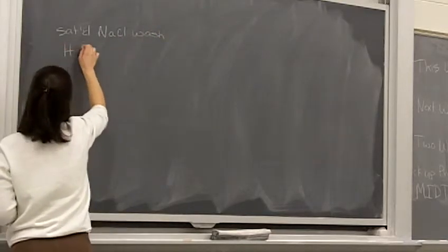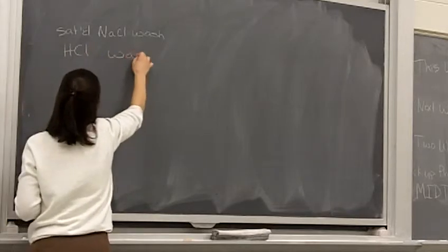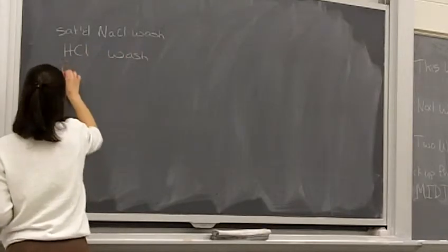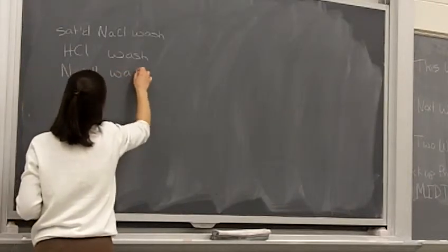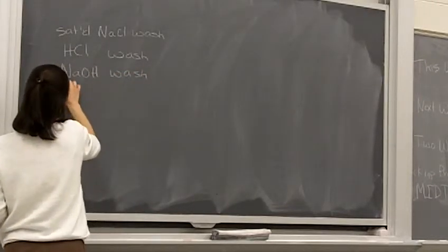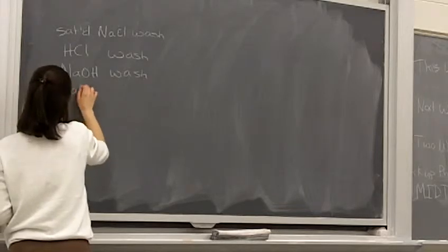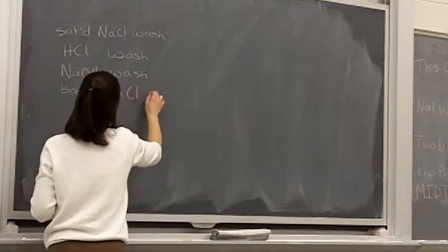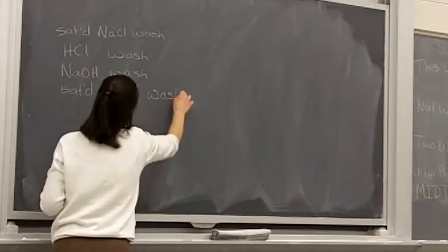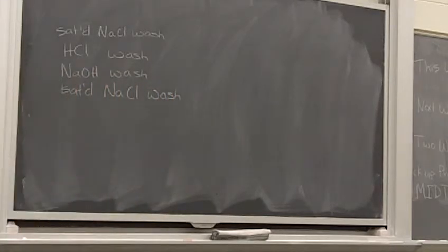We've got an HCl wash. We've got an NaOH wash. And we've got another saturated sodium chloride wash. Okay, so we've got these 4 washes.